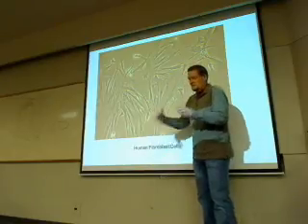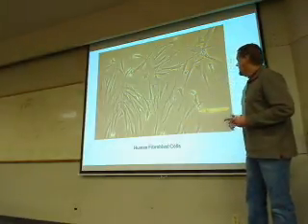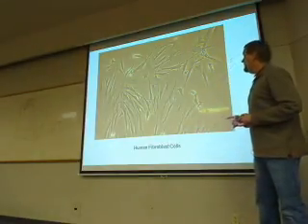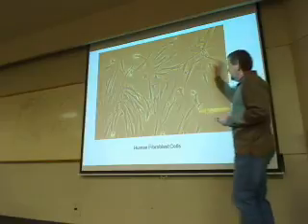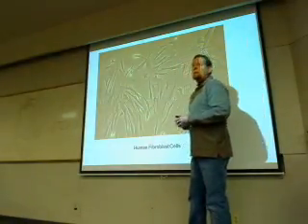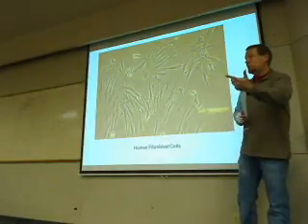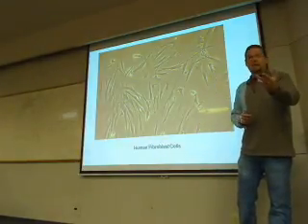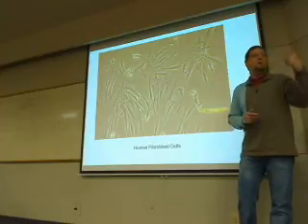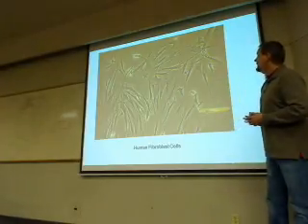The fibrocytes sit around and just make these fibers to help maintain the homeostasis and health of the tissue we're talking about. This is a real typical looking group of fibroblasts here. They would be making collagen fibers, reticular fibers, and elastic fibers, because those are our three fibers of connective tissue. So that would be their role in any connective tissue.